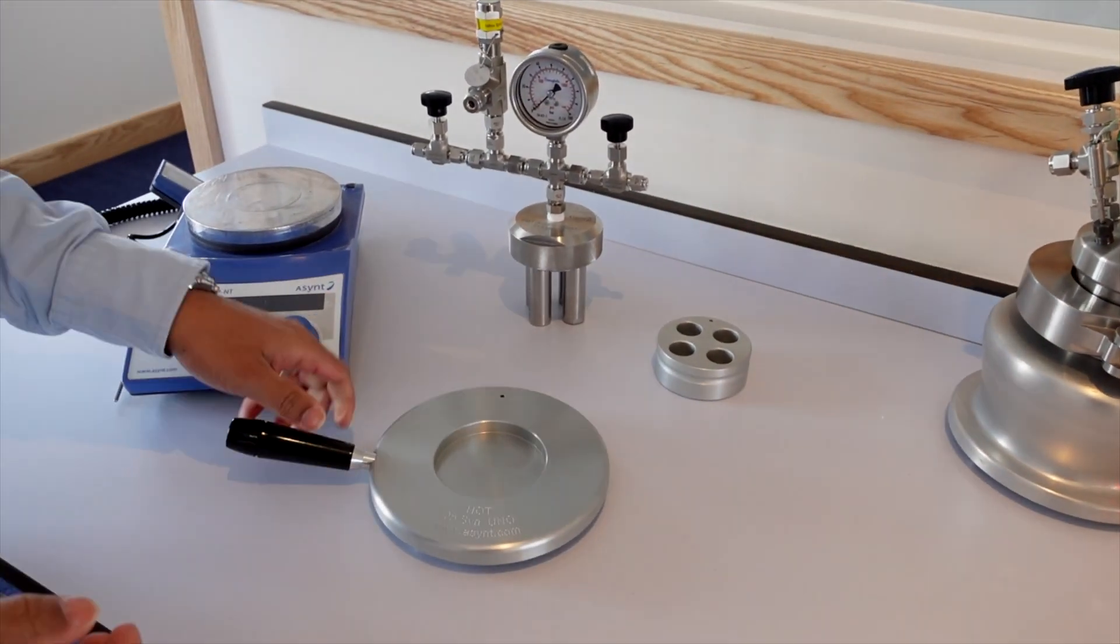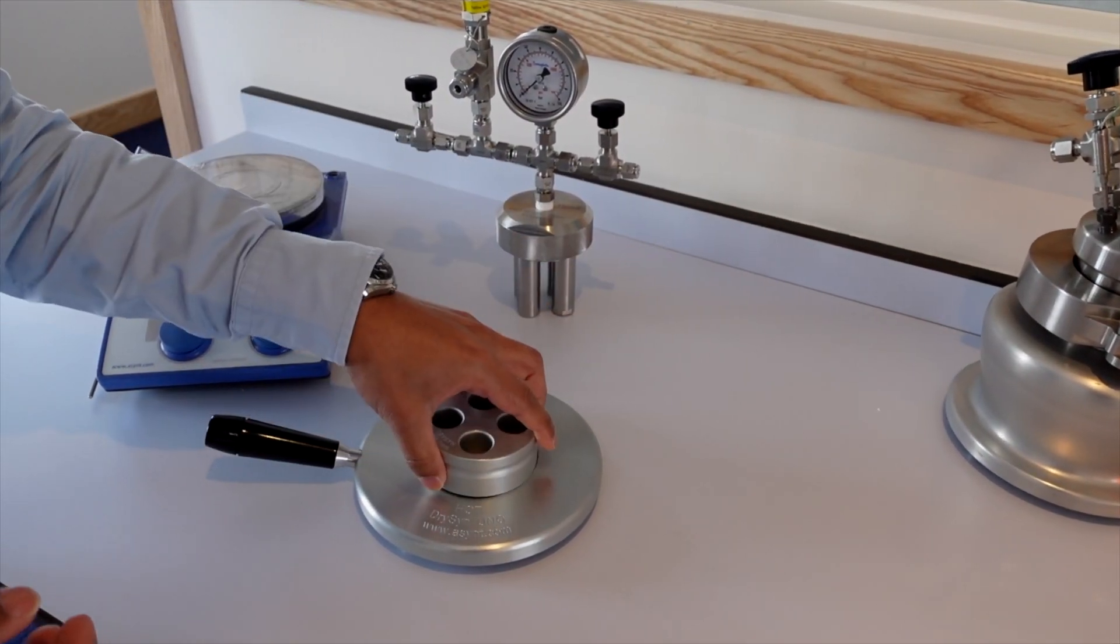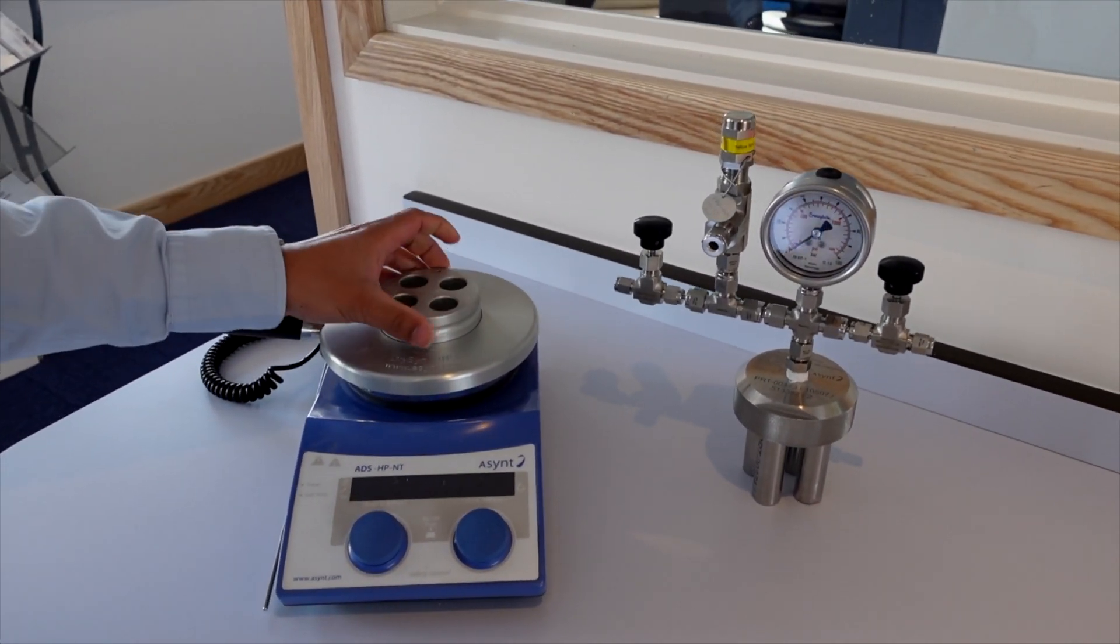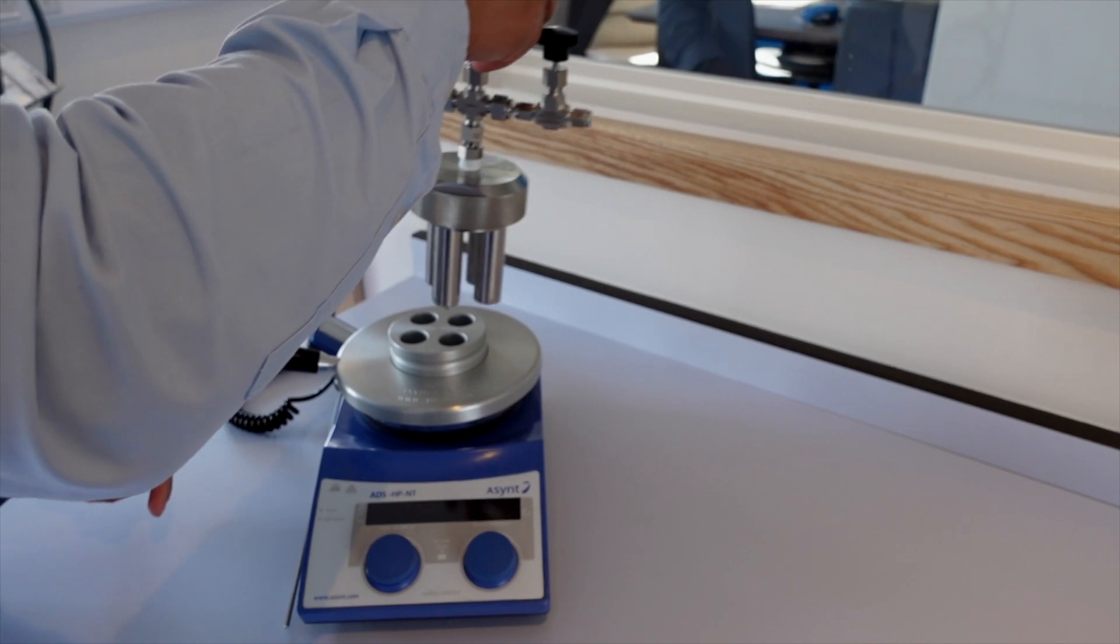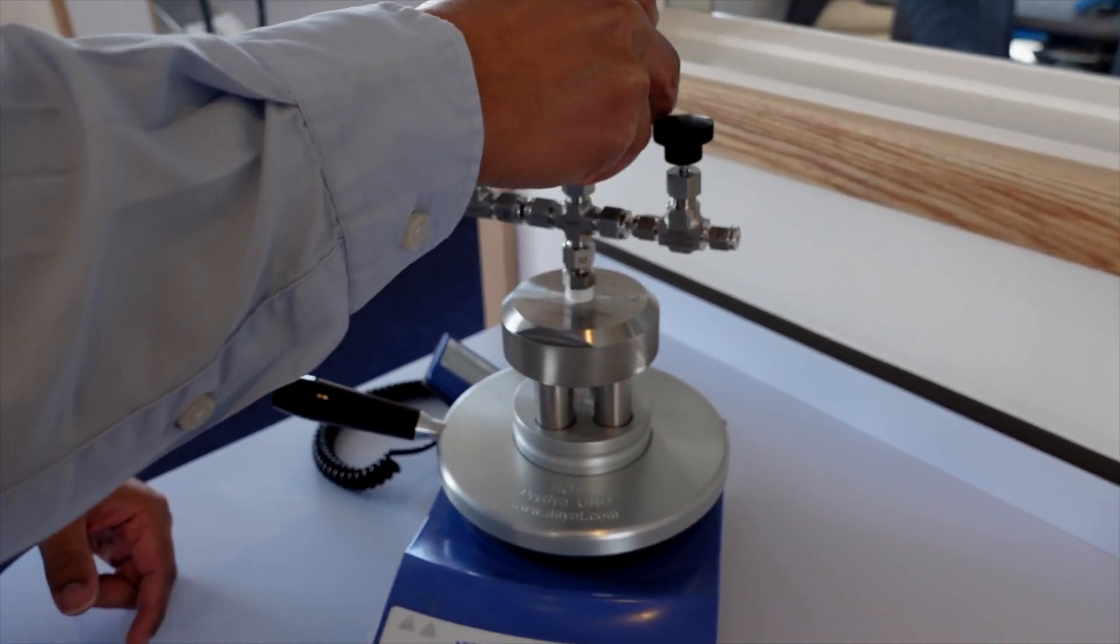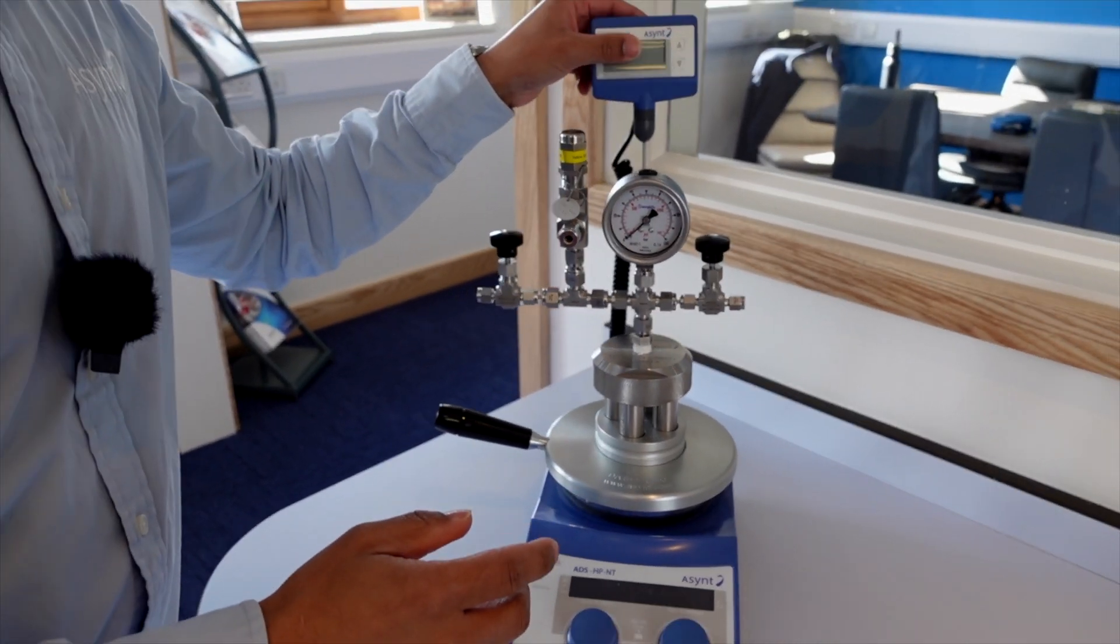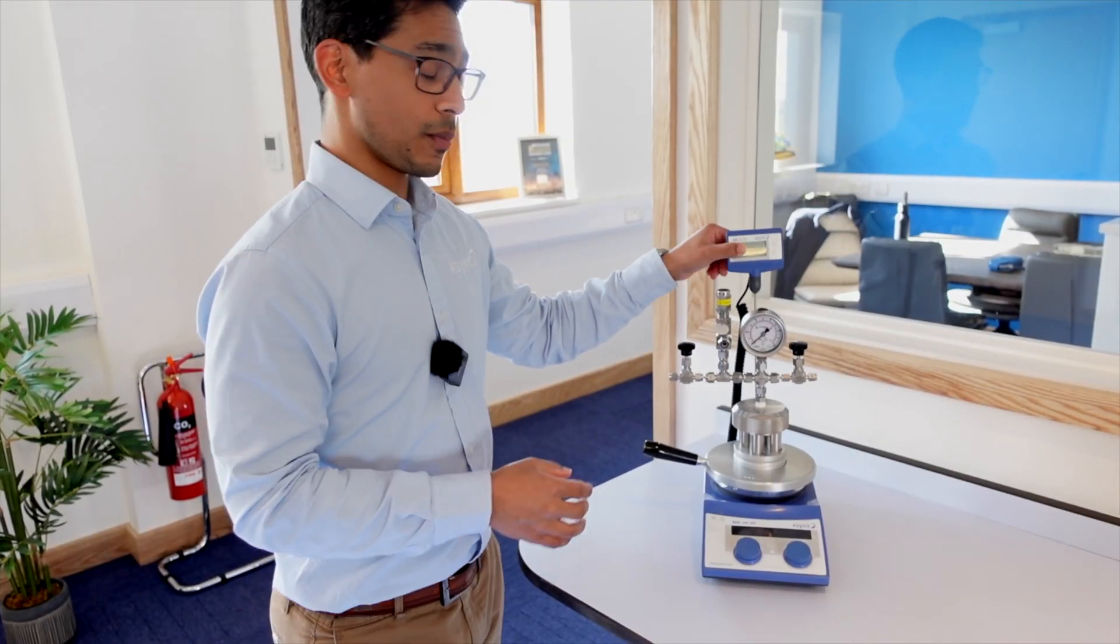You've got the base and the reaction vial insert, which when mounted on the hot plate stirrer, you can just easily slot the QuadraCell into. And with a hot plate thermocouple, you can control the block temperature.